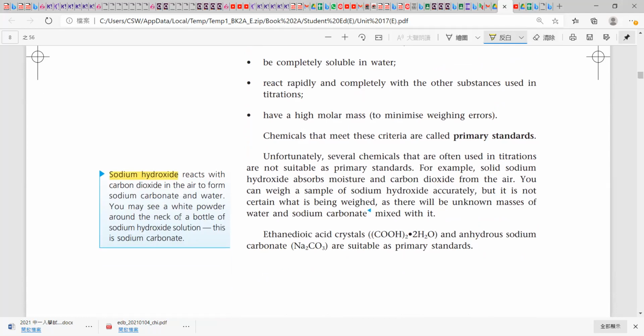Because it is said to reabsorb moisture in air. OK? 咁啊，頭先都講咗㗎啦。咁所以咧，you cannot just weigh the sodium hydroxide accurately, and tell the solution having a known molarity. Why? Because some part of them may have absorbed moisture in air, and worse still, part of them may have absorbed carbon dioxide in air. So it would affect our overall molarity.